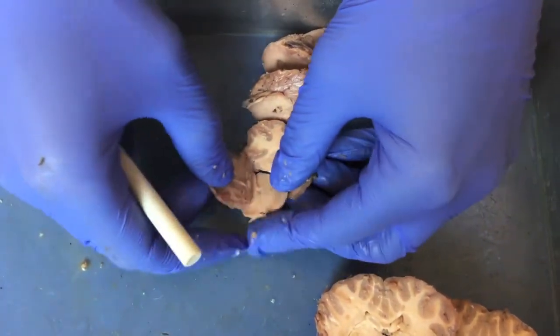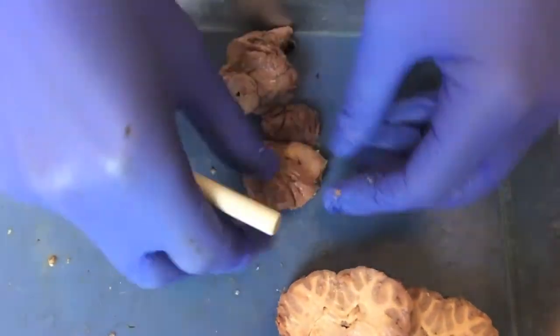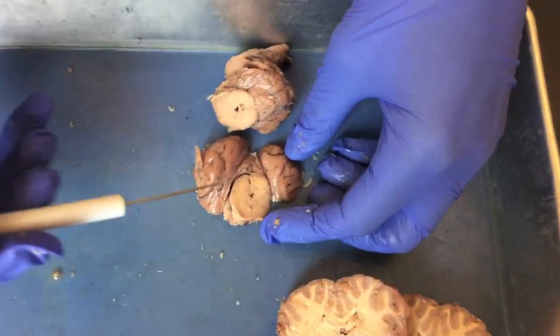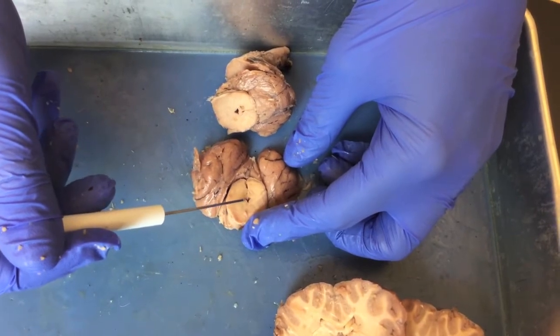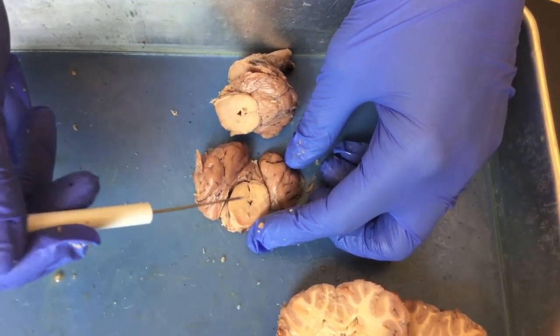And if I turn this section over to look at the more posterior end, you can again see the cerebral aqueduct is this roughly circular shape. This is a good landmark for knowing whether you're looking at the midbrain.